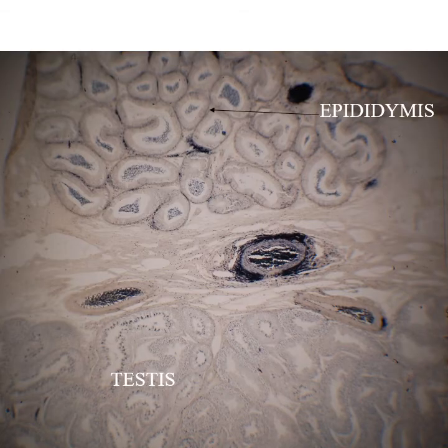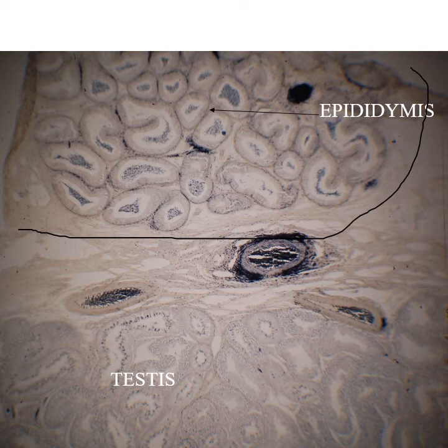This is also a slide of the testes and the epididymis, a different organ. Up here is the epididymis. We'll talk about that again next week when we do male reproductive. But that is a section through the epididymis, which lies right alongside the testes. They're also tube-like, but one of the ways you'll tell them apart from the seminiferous tubules, you can see the outer edge of that tubule right there, and then you see the inner edge. It's sharply defined. It's like you cut through a rubber hose, and you may see sperm in the middle of these things depending on how it was prepped.